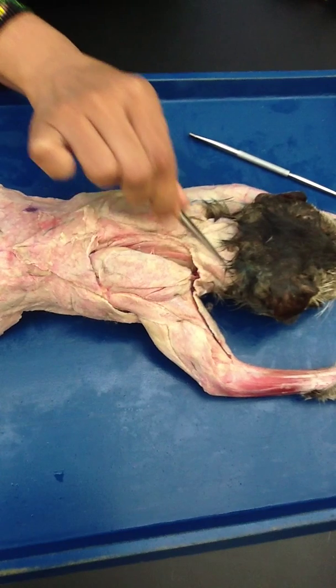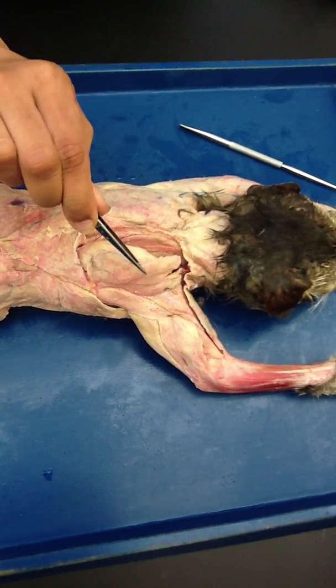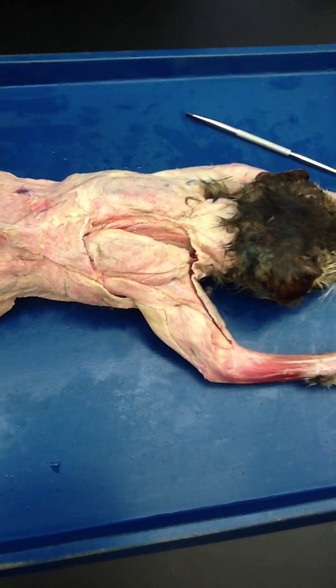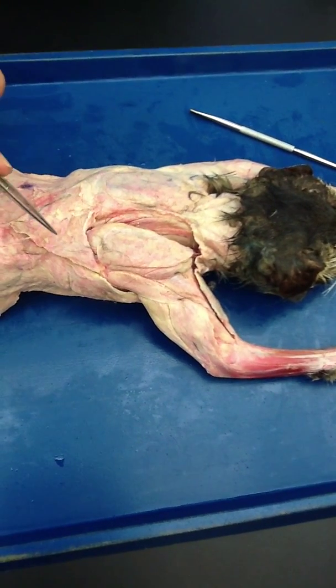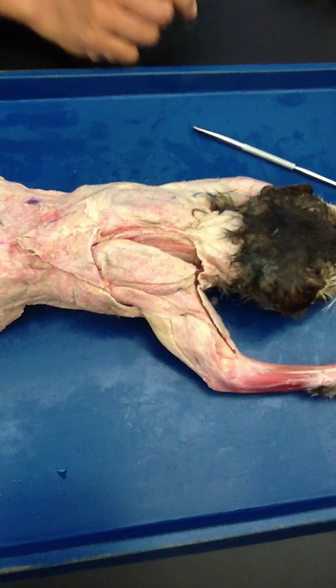Clavotrapezius right here, acromiotrapezius, and spinotrapezius. Cats are sweet!